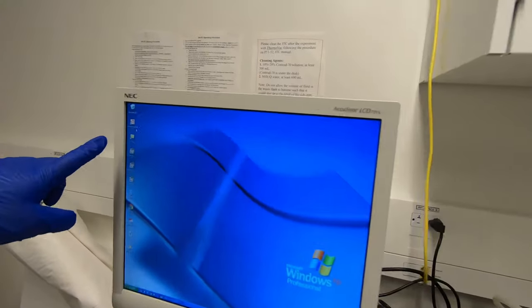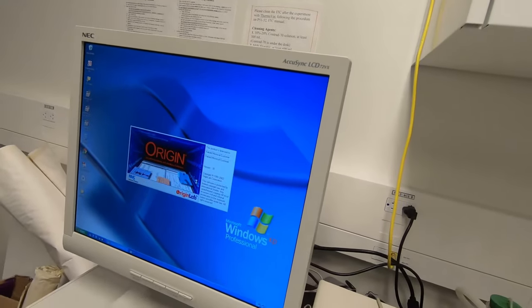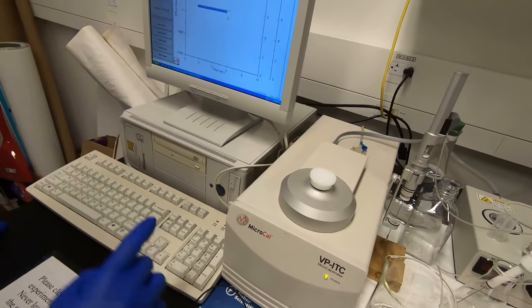This is the software you will need to use — the VPViewer 2000. This software is used together with the ITC device. When the device is on, this software has to be on with the device.